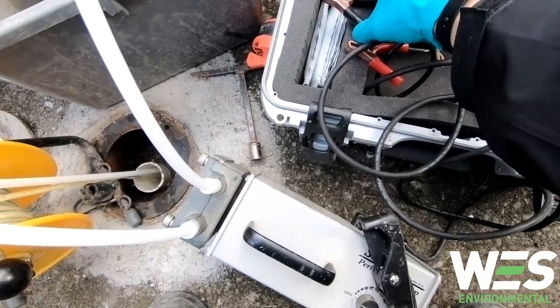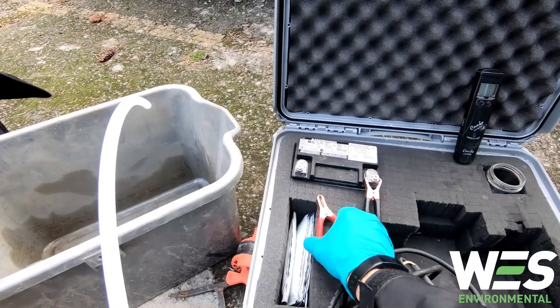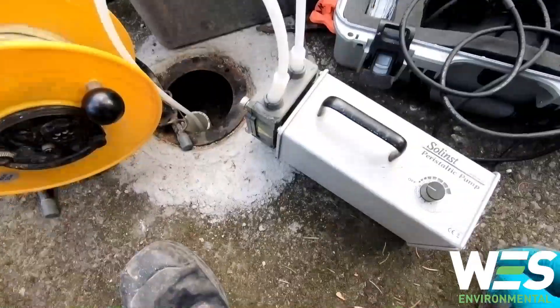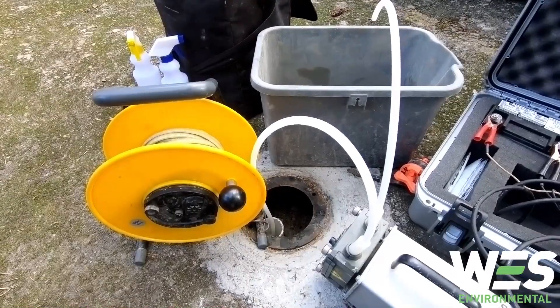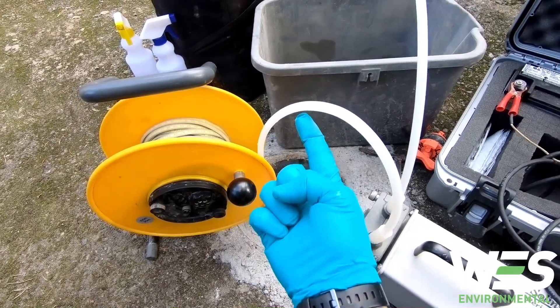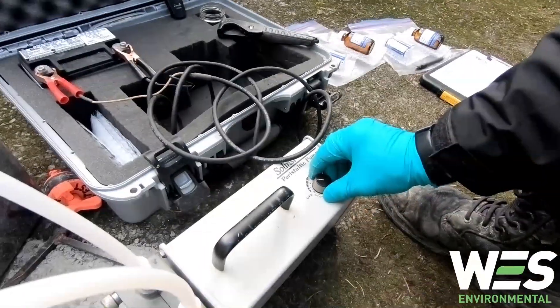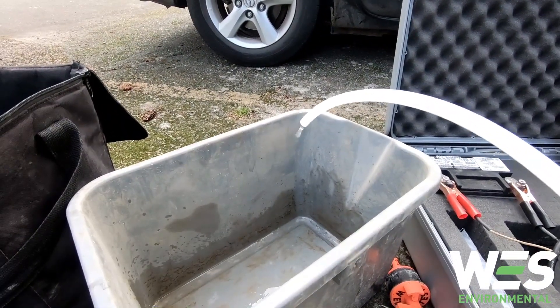And then I'm gonna hook up the battery and then turn it on nice and slow. And there it is, you can see it coming up the tubing. I usually play with the variable pump speed here so I get somewhat of a decent trickle.